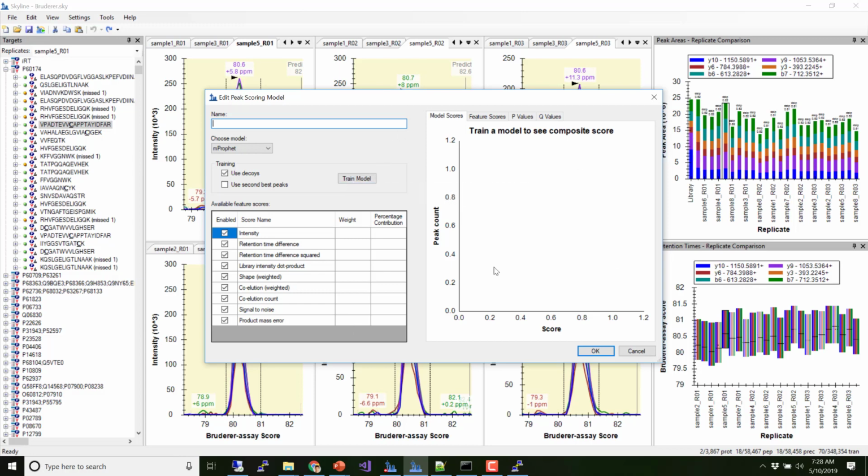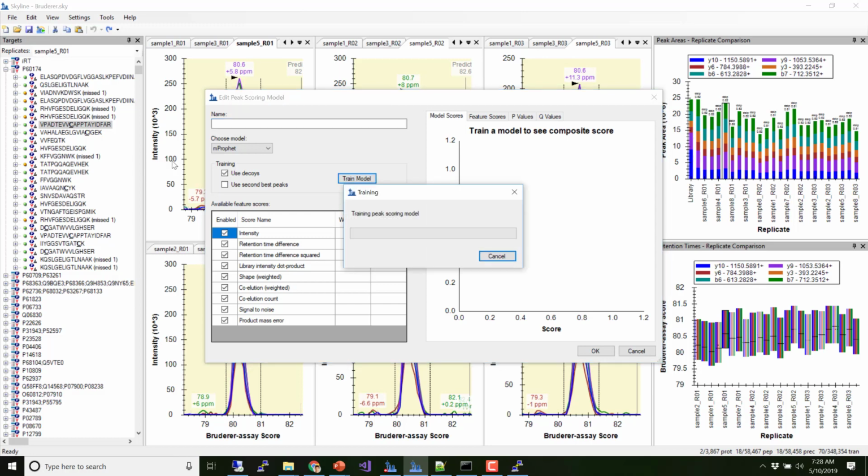Is everybody facing the big thing? No, we got a really slow person again. Once you get there, it doesn't matter. As soon as you get there, just click train model, because that also takes some time. So we want to get to where we have a model for the brood data. So we got all the scores, and then we want to train them.